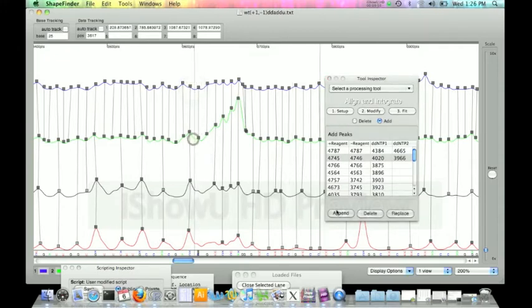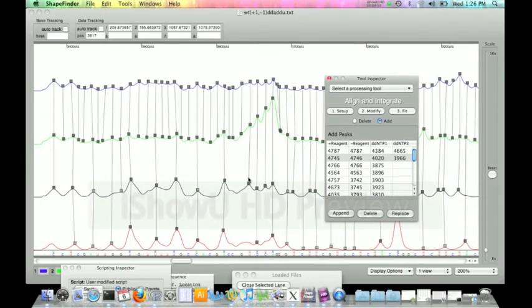You know, it's your discretion. You can play around with adding certain ones, just getting it to line up. And there we go. It's still looking pretty good. So we have our A here. Now the sequence is telling us that this A should be back 1, but given that this DDU curve is pretty fat, I would say there's a possibility of either of those positions being that A peak. So I'm just going to go ahead and drop that there, and there you go.